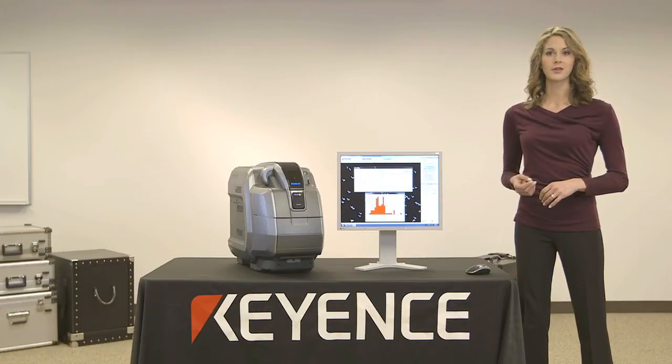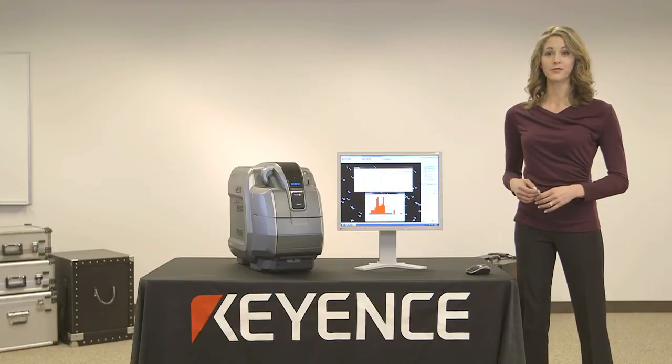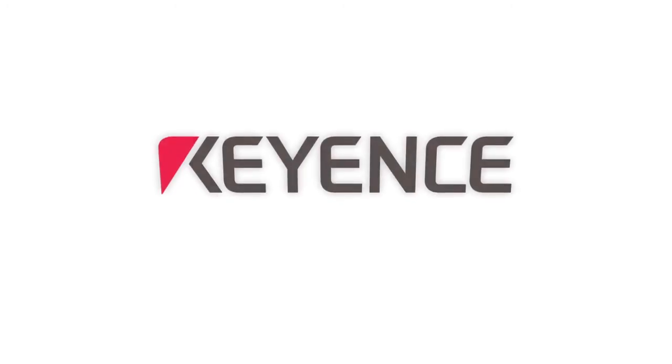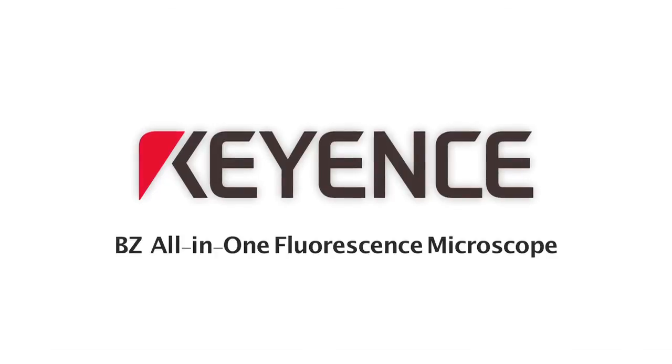With its extreme ease of use, this system makes a great complement to any lab for fast and easy imaging and analysis.